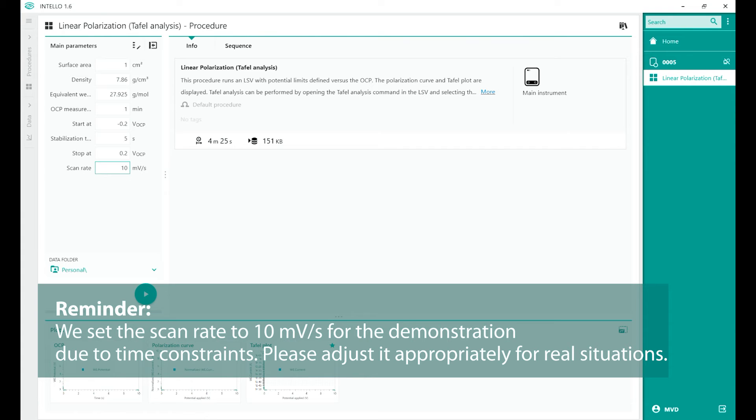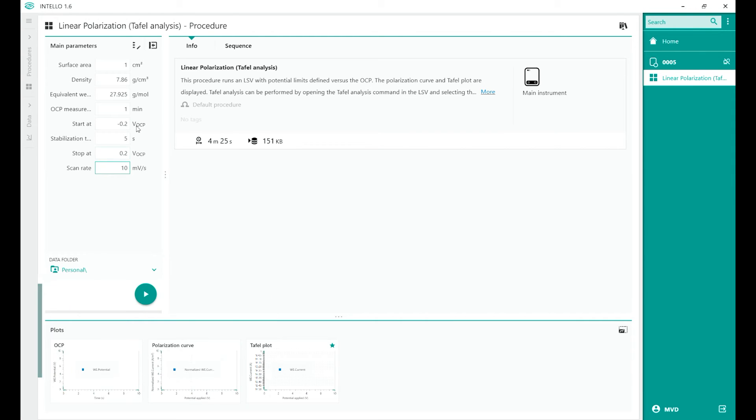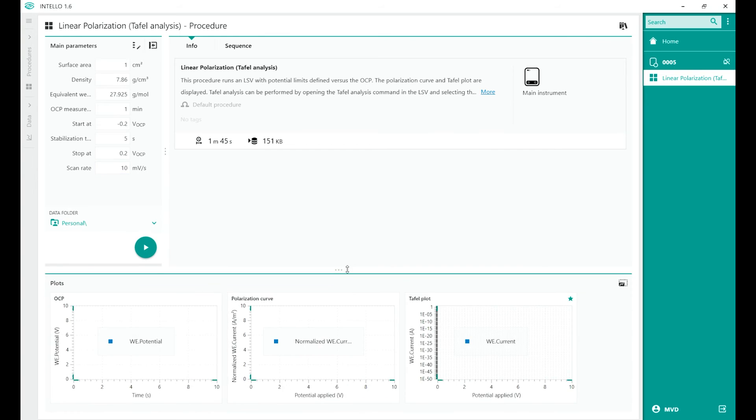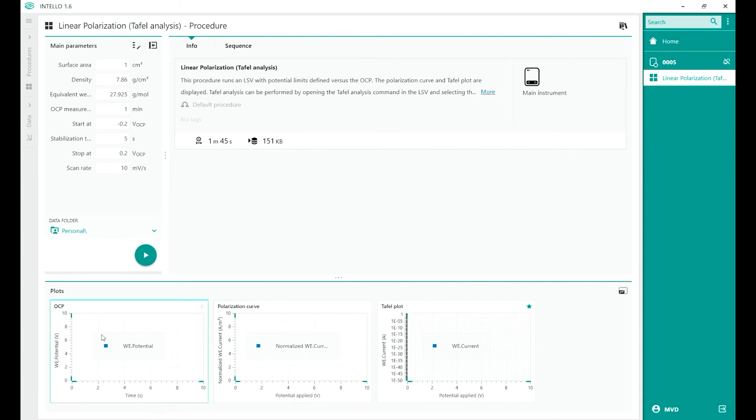Normally you scan at a very low rate, but for this video we're going to speed up the process. We're going to scan from minus 0.2 volts versus OCP to plus 0.2 volts versus OCP. After this adjustment is done, we can increase the plots, polarisation curve and TAFEL plot. Everything is set. We have our instrument selected. Procedure is ready to start.